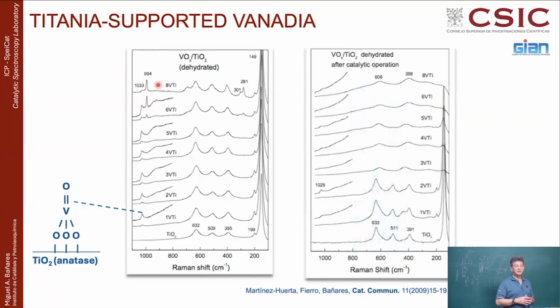We were using this catalyst for ethane oxidative dehydrogenation, which means ethane and air to make ethylene, at 500 plus, 600 degrees centigrade, and the catalysts look very different after reaction. The same family, this is before going to catalysis, after going to catalysis. They are totally different. Why is that? Well, the titania doesn't really change.